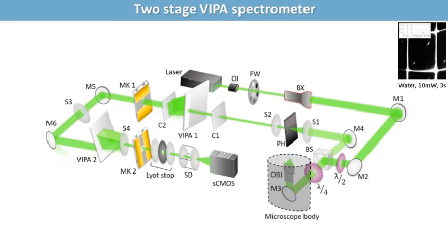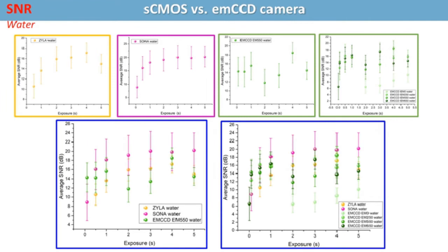So the camera is an imaging camera because we obtain a readout that is based on extracting a spectrum along the diagonal. Here is the dispersion axis. So the measurement lasts up to a few seconds, but we can go much faster depending, obviously, on the camera, but also the sample itself.